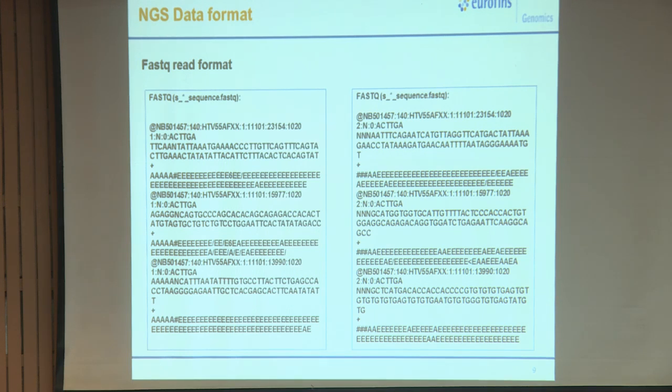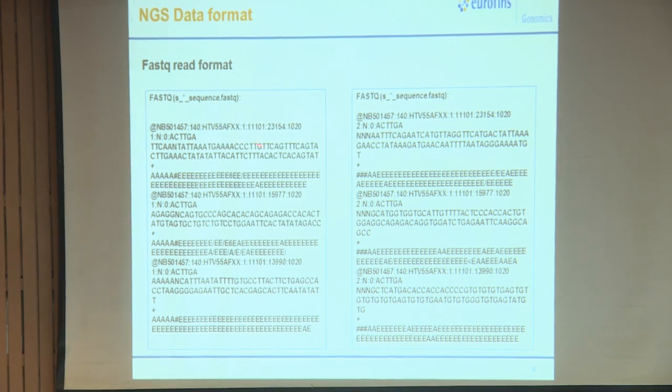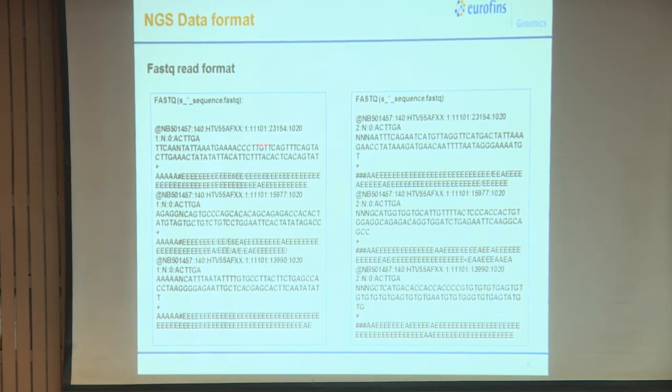When we are doing a sequencing, we have a flow cell which is barcoded, and universally in Illumina products that will be unique. For example, if a run fails, Illumina can detect which flow cell it is, which lot number it is, and whether that particular lot has gone off. That is the way you can trace your flow cell, followed by the tile number.